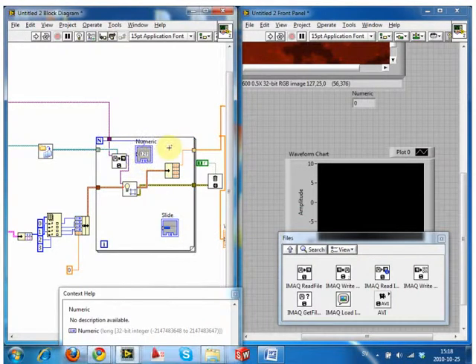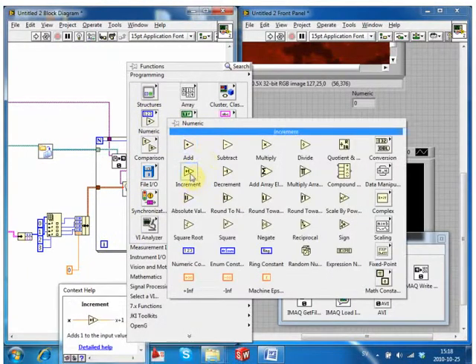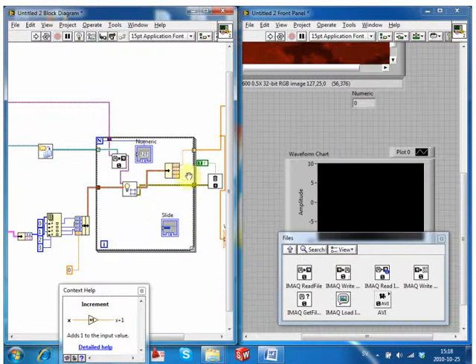The way I would do it is essentially go to the numeric palette and add 1 to I, so that your first one is 1, because 0 divided by some value in some functions doesn't fly too well. And then, in the numeric palette, you're just doing a simple percentage operation.